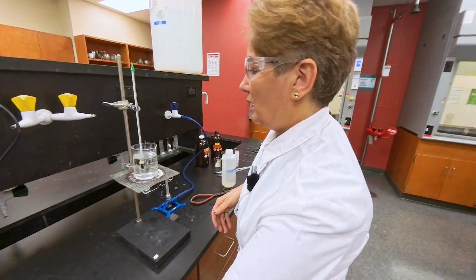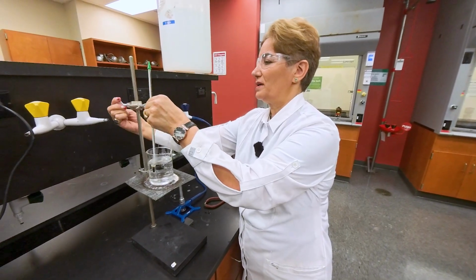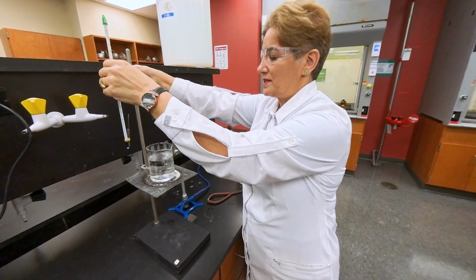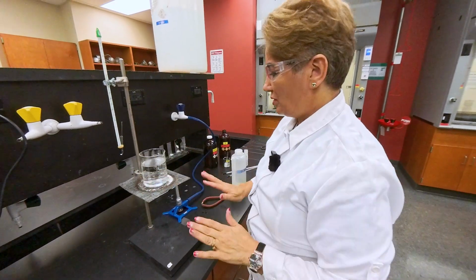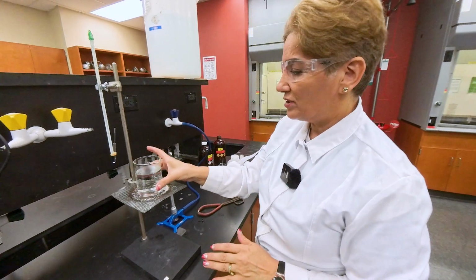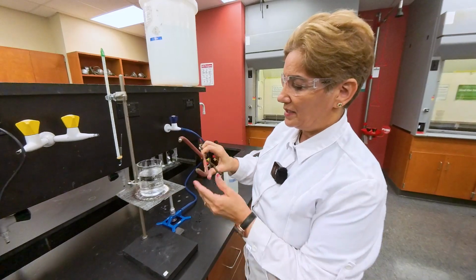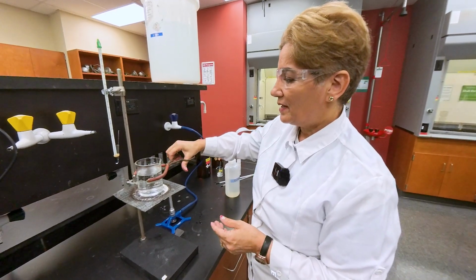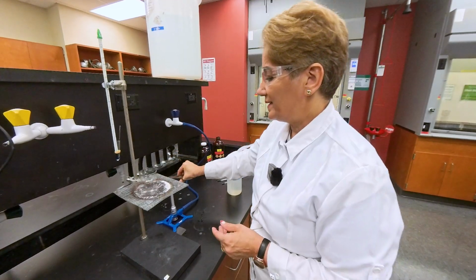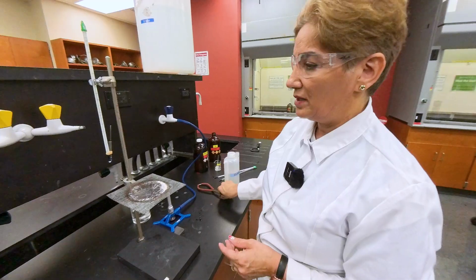When you are done with measuring the boiling point, of course, you are going to separate all the different equipment that you used. The only part that I want to make sure of is that you turn off the Bunsen burner. The beaker is hot, do not touch it, and the proper equipment to use is a beaker holder. With the beaker holder, you can remove it, place it on the side until it's cold, and then you can touch it or take it to the sink and dispose of the hot water.